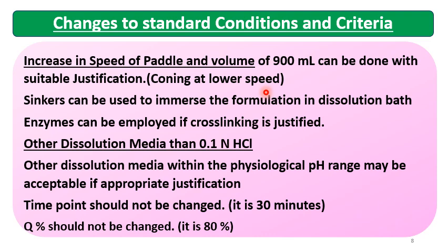Then if you stretch it, it will not become an IR product containing highly soluble drug substances. If you go to 45 minutes, then your product is not eligible for this criteria. So 80% is a must, and this 30-minute time point is a must.